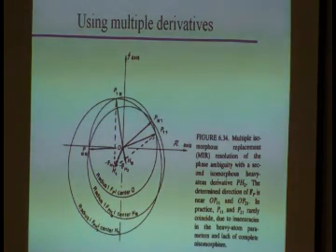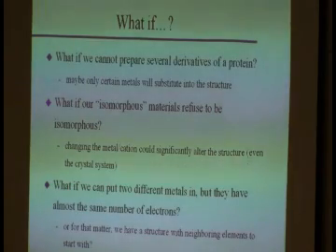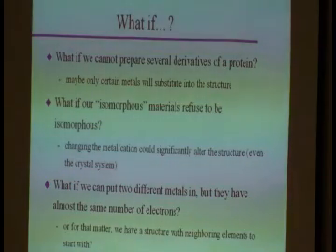You can do that manually. Obviously nowadays computers do the work for us, but this is how you could actually figure out your phase if you have heavy atom derivatives. All right. So that sounds beautiful, right? But there's a what if to it.